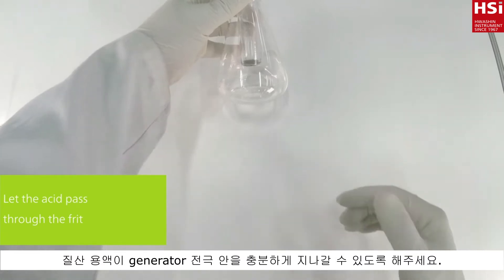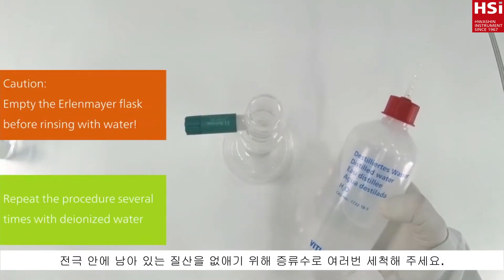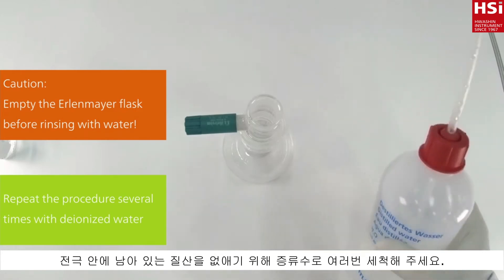Wait until all nitric acid passes through the frit. Repeat the procedure with water to remove the acid.